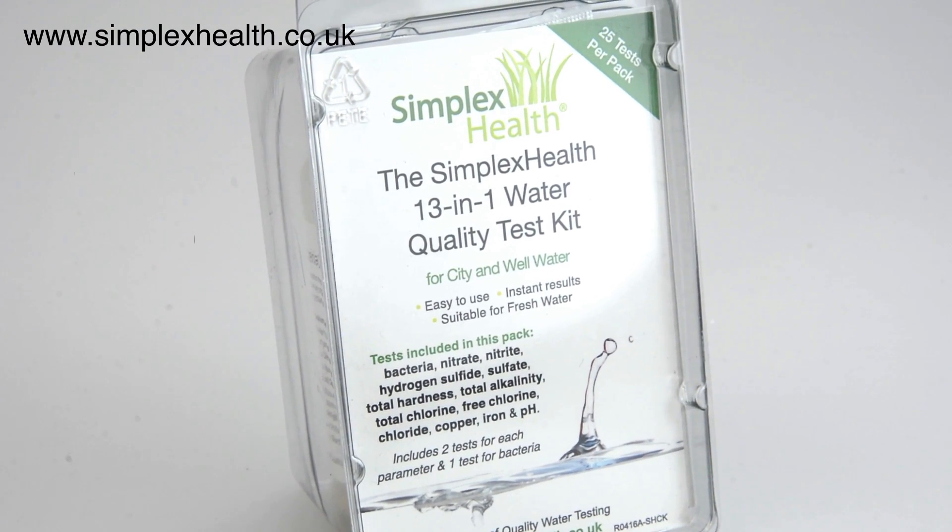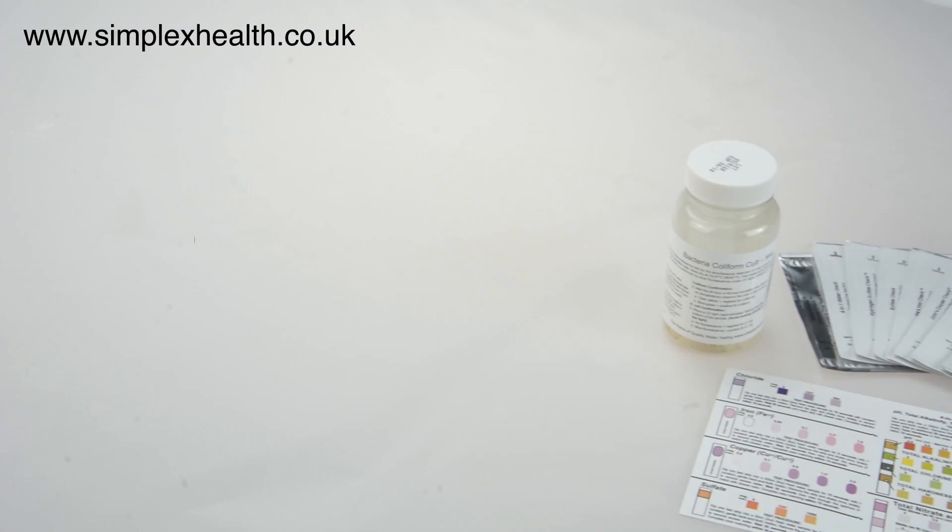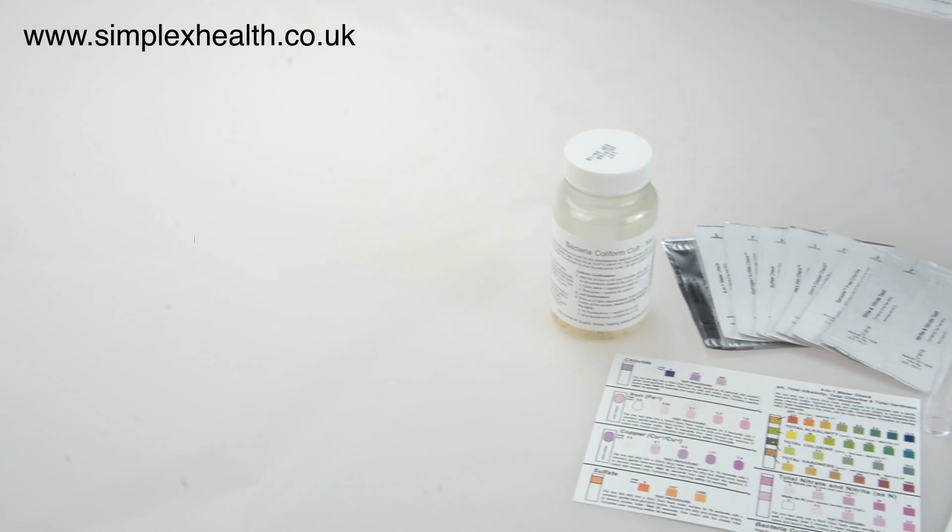Hello, my name is Carolyn from Simplex Health and in this short video I will show you how you can easily test your water for 13 of the most common elements.